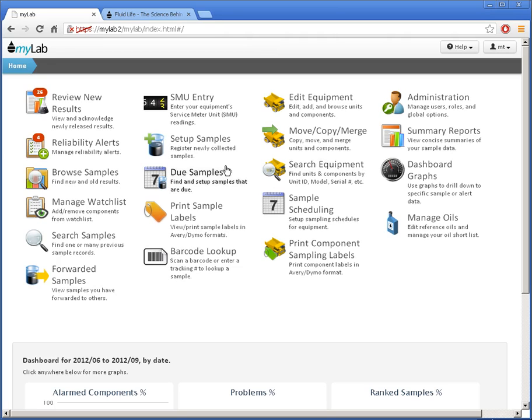Hello, in this video I'm going to show you how to set oil defaults using FluidLife's myLab. Setting equipment oil defaults makes sample registration faster and less error prone. Plus, the lab always knows what oil I expect to be in the equipment and can tell me on the results if it isn't. To set defaults, first I need to tell myLab which oils I use.